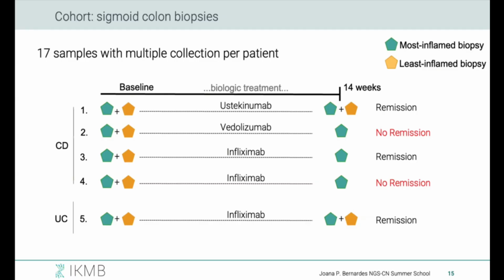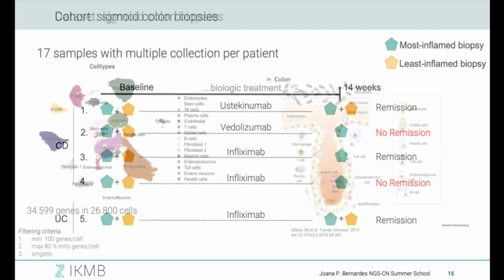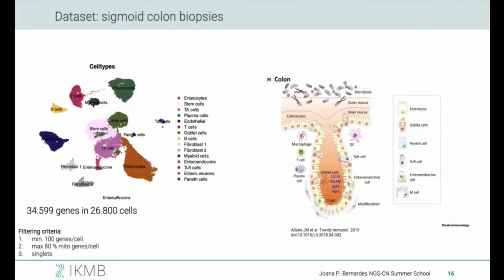And as I said, we took intestinal epithelium. If you have ever worked with intestinal epithelium biopsies, you might know that these are very difficult to deal with, but we now have a protocol, and we're going to be publishing it soon. If anybody is interested, I can share a preprint of protocols to process these types of tissues. This was our first round of successful processing of biopsies. Now we have even better protocols, so you can acquire up to 12,000 cells per sample. It's just a little detail.